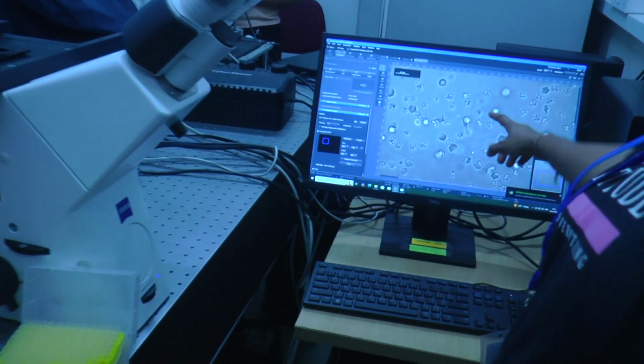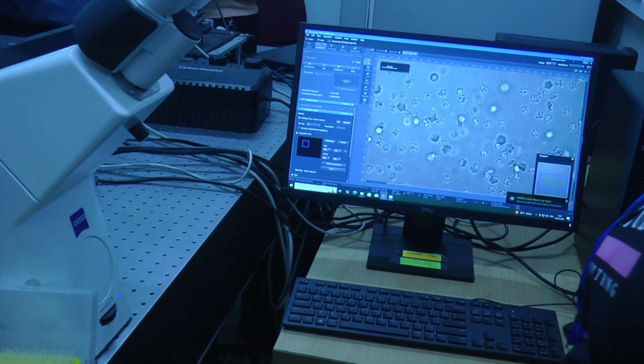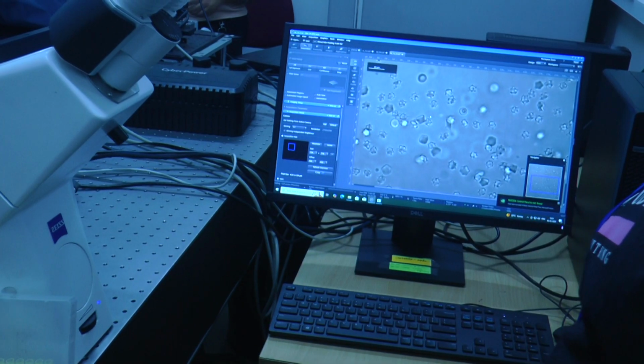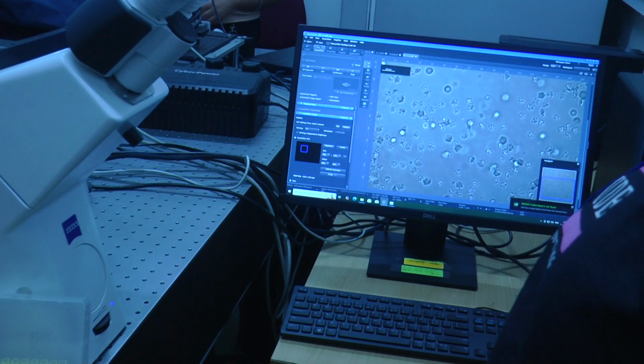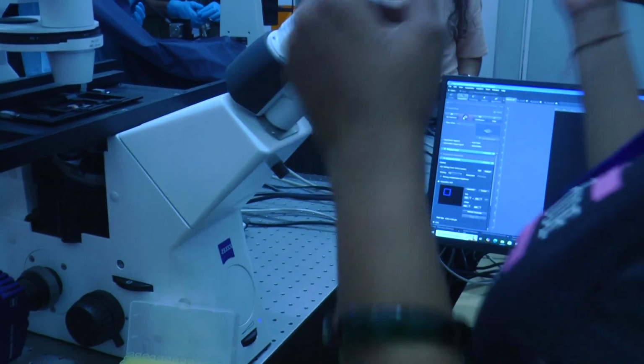See, these are crenated cells for 1.2%. Shrunk ones, right? Yeah. They've just collapsed like this, because suddenly the water from inside has gone out.